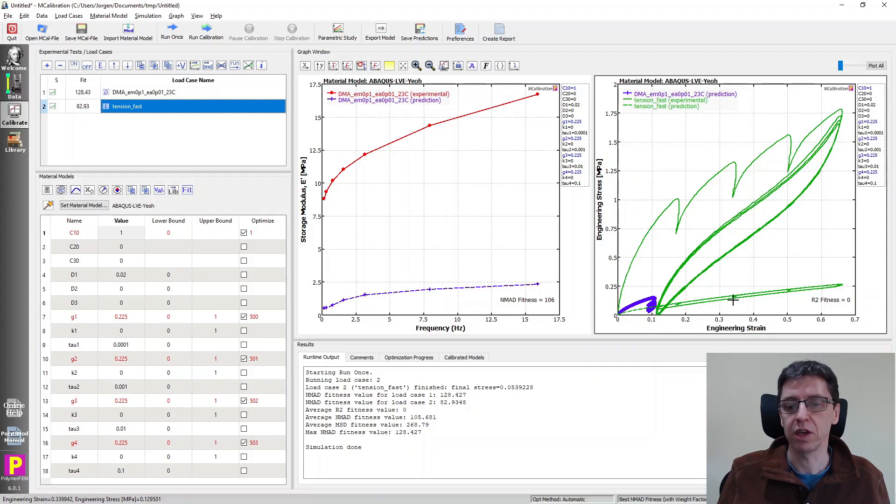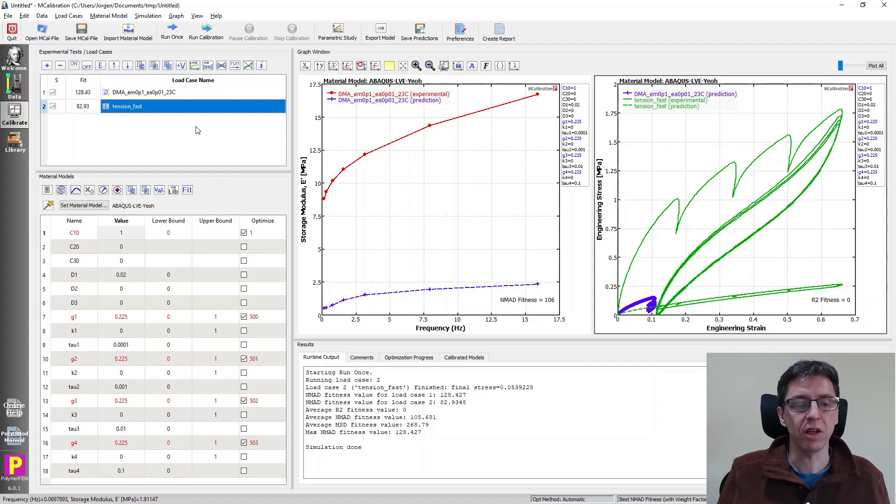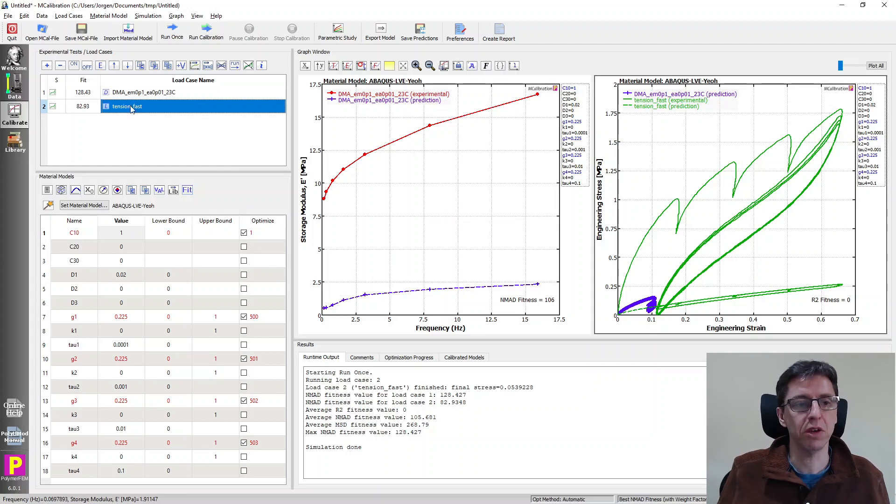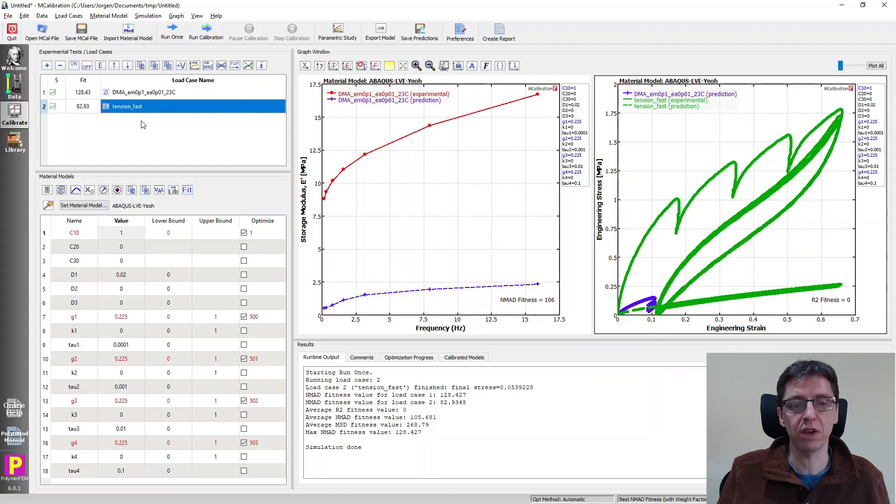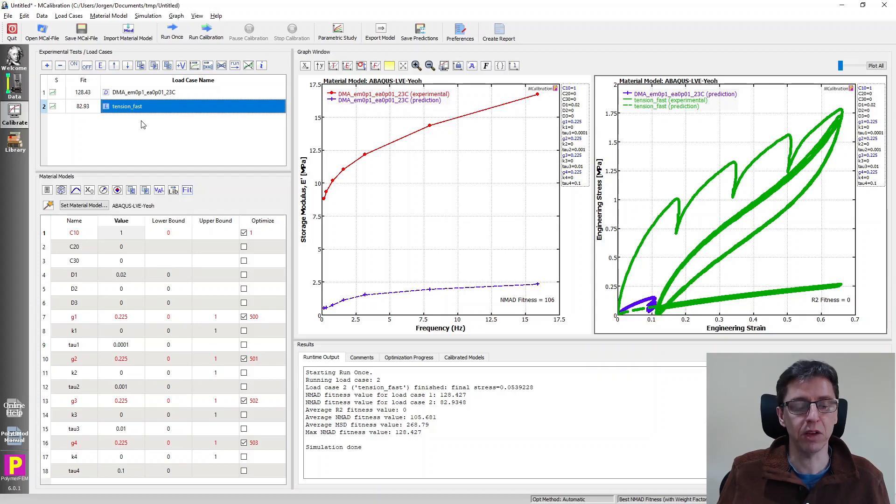But that's the value here. In MCalibration, you can combine both DMA data, retention data, whatever data you have, and it can calibrate to all data at once.